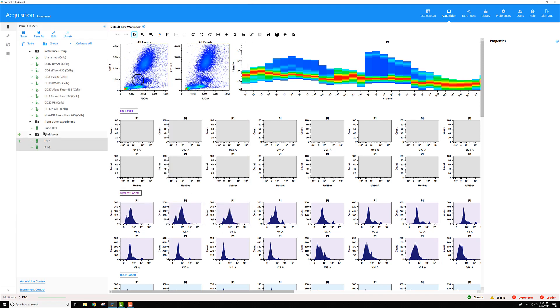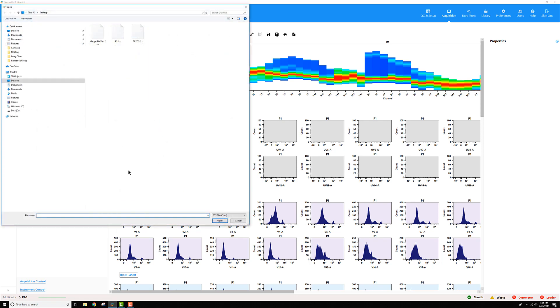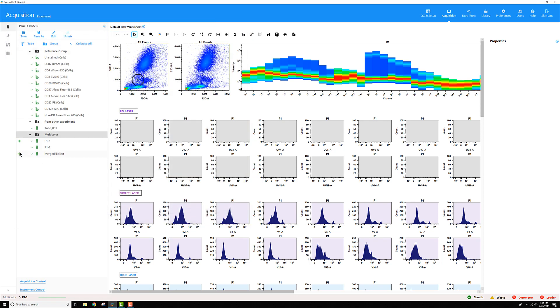Then if you want to bring that file into the experiment, simply right-click on the group that you want to import the tube into, select Import FCS File, grab that file, and now my file appears.